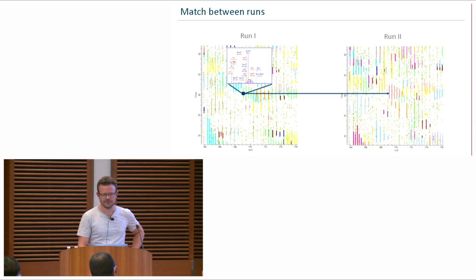Okay, so the first problems are solved, right? So we found our peptides in both samples at the retention times, and we could now compare them.